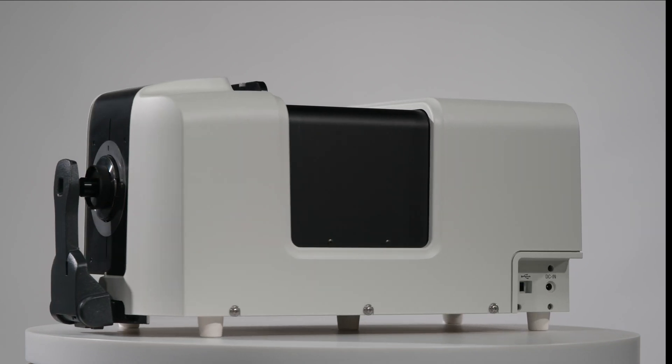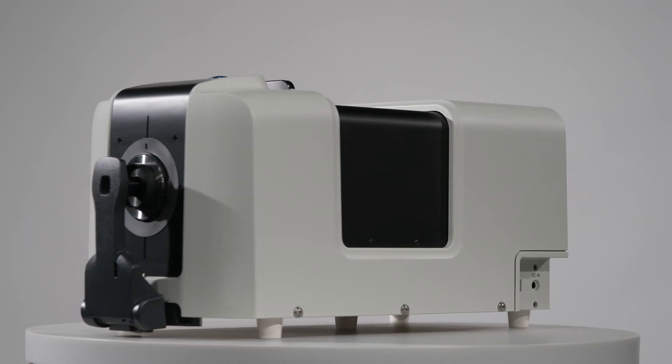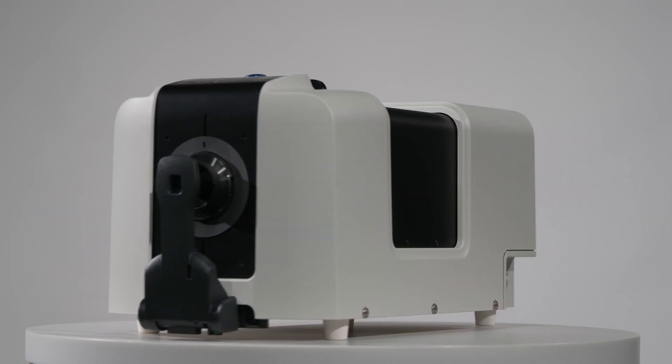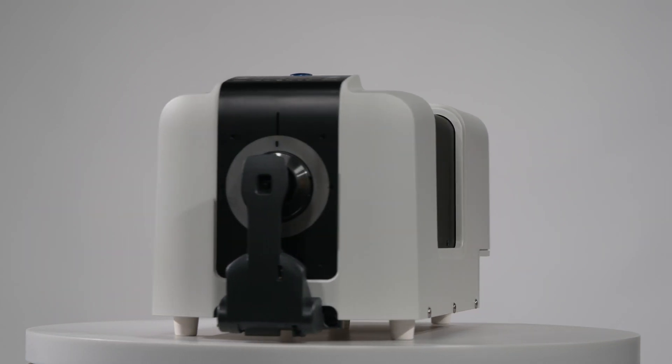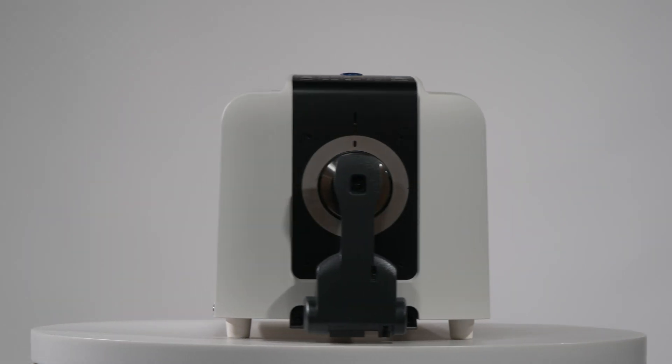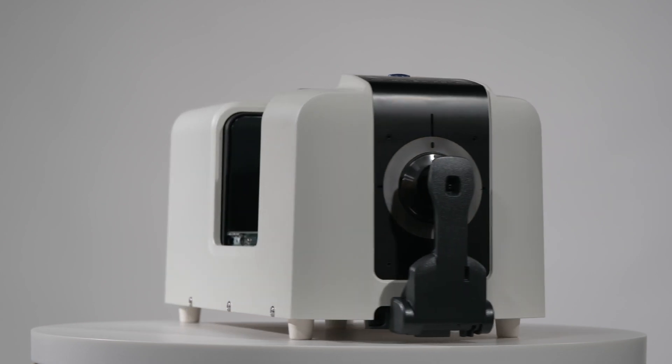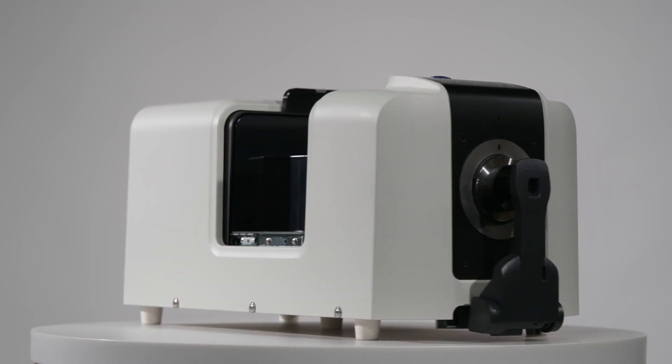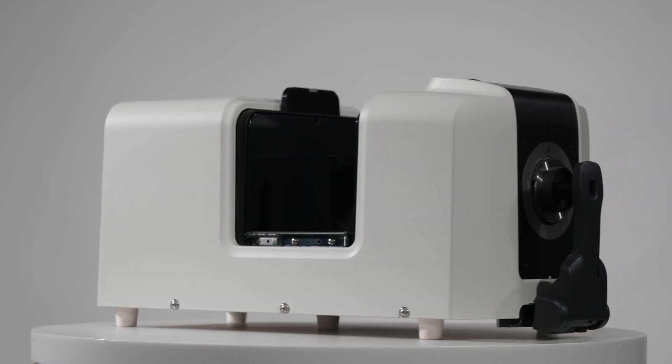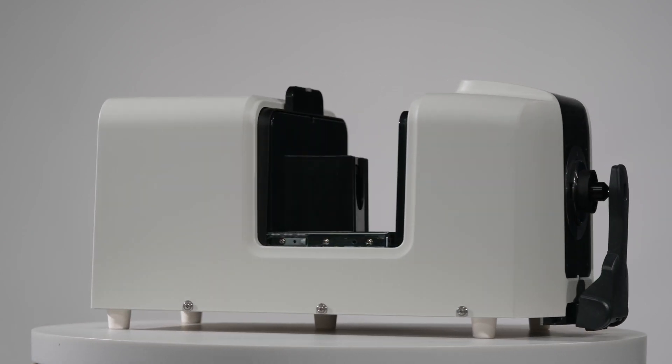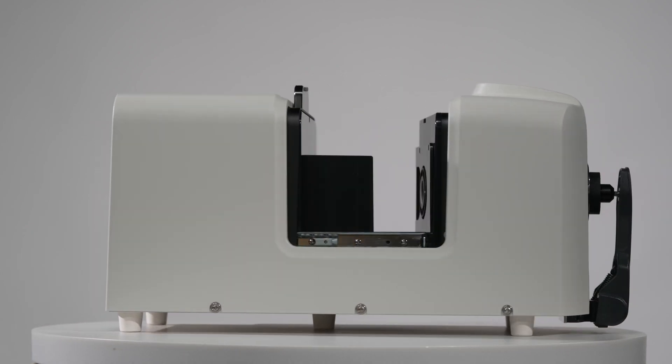The CM36DG Spectrophotometer from Konica Minolta Sensing is a highly accurate, easy-to-use benchtop instrument that allows users to measure color and gloss in the same reading.